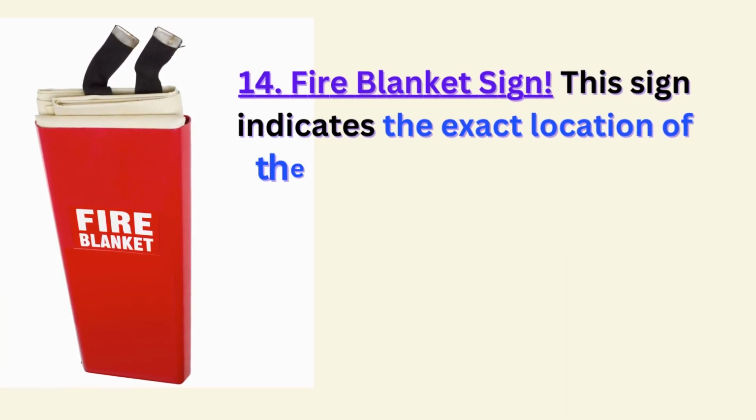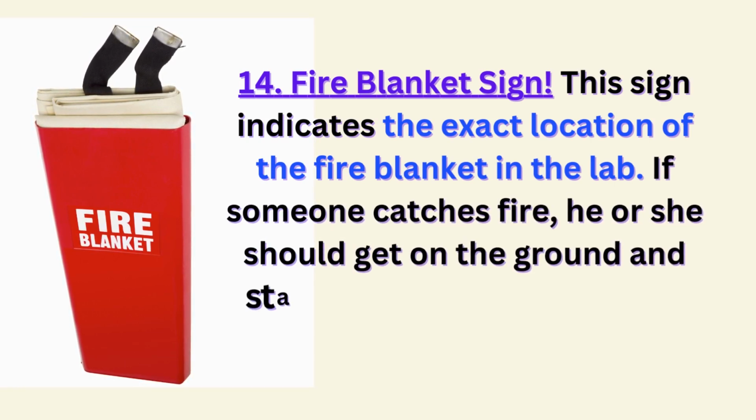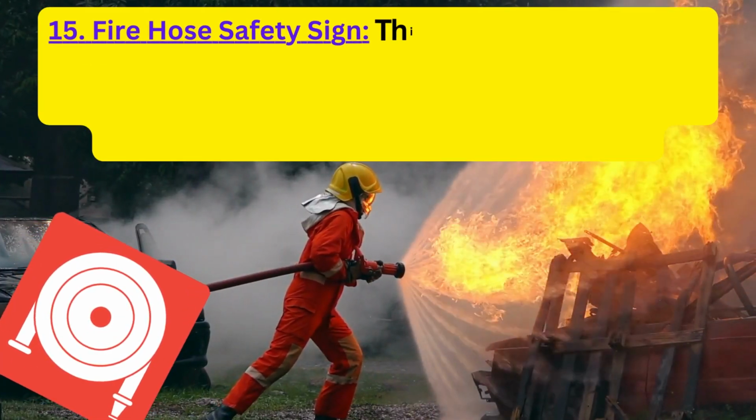This sign indicates the exact location of the fire blanket in the lab. If someone catches fire, he or she should get on the ground and start rolling to extinguish the flames using the fire blanket.